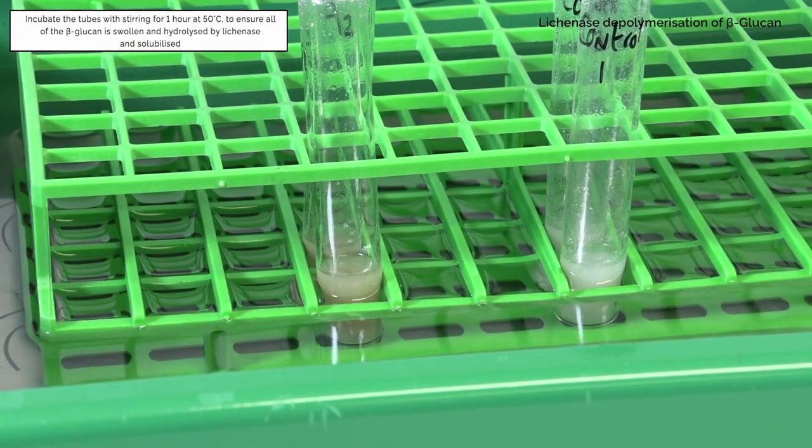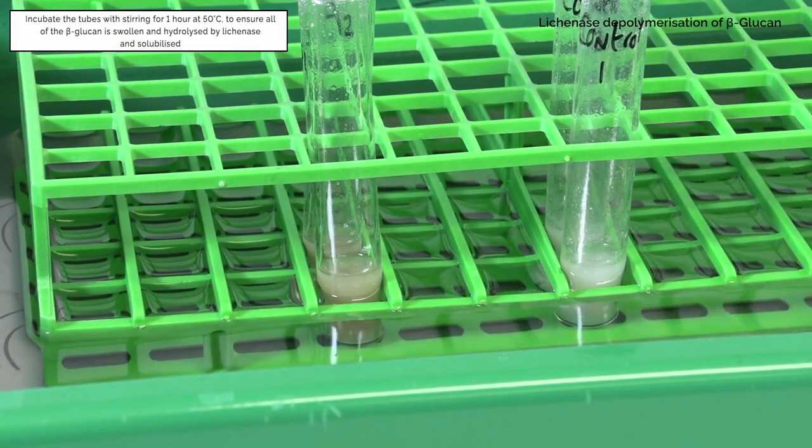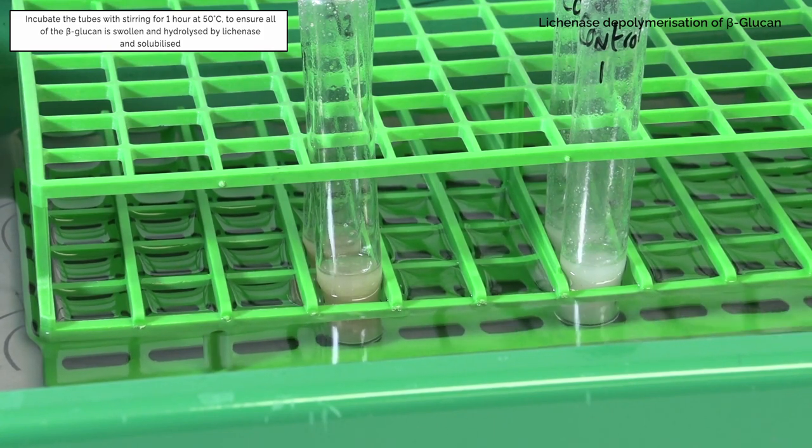Incubate the tubes with stirring for 1 hour at 50 degrees Celsius to ensure all of the beta-glucan is swollen and hydrolyzed by lichenase and solubilized.